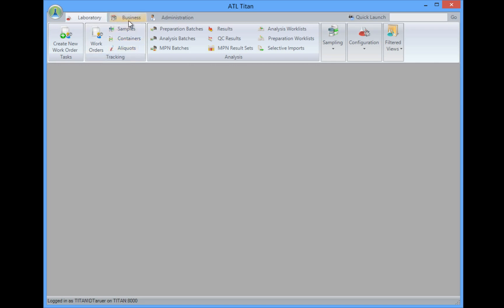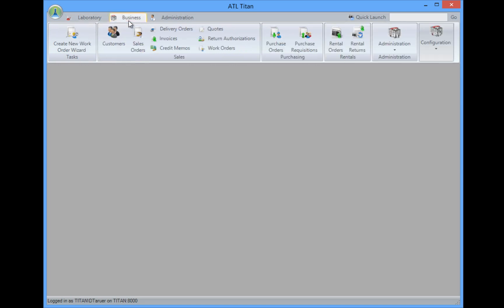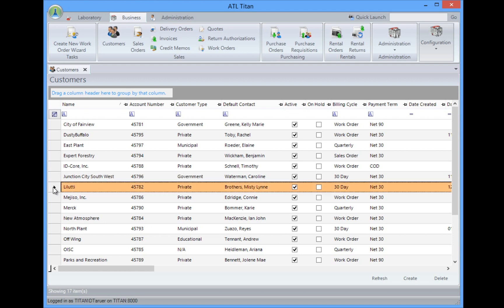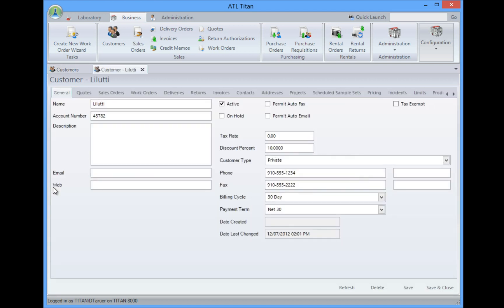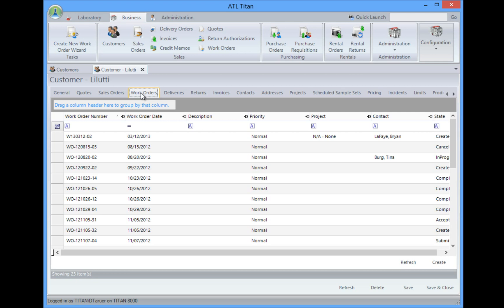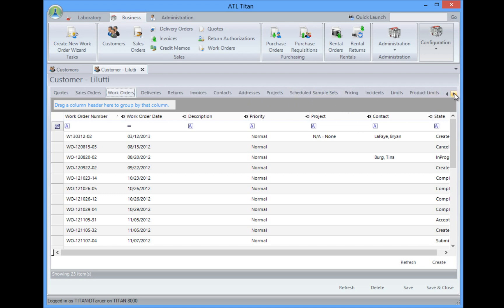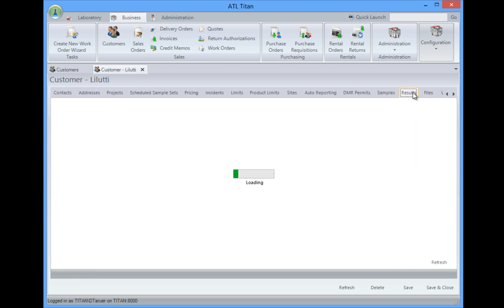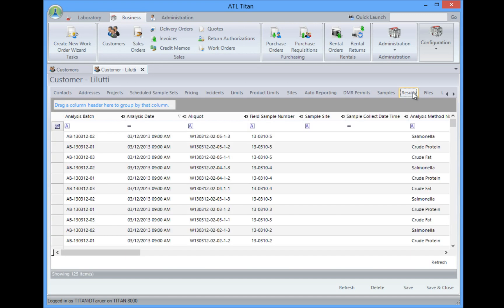Moving over to the business side, take a look at the business, we can do things by keeping track of customers. Customers will allow us to actually open the customers and take a look, and similar to a work order we can go into customer, we can see information on that customer, any quotes, any sales orders, any work orders ever performed for that customer. Deliveries, we can track returns, invoices, contacts, projects, scheduled sample sets, we can schedule things that happen automatically, and even right from the customer we can jump right in and we can take a look and see the results for that customer. So this would be a listing of all the results ever for the customer.